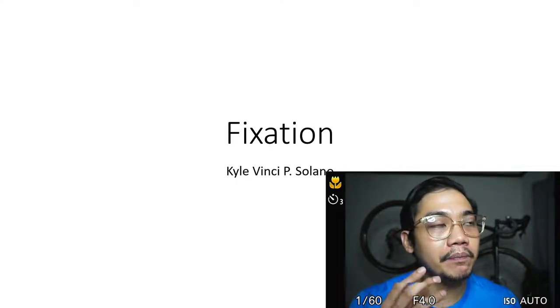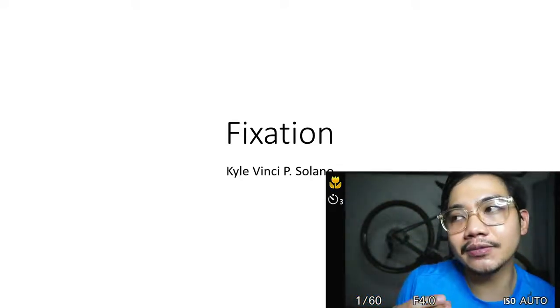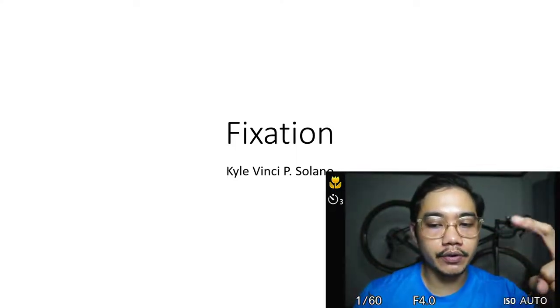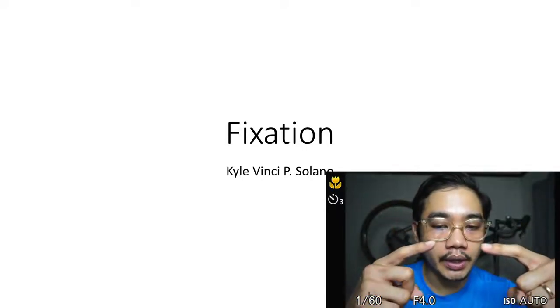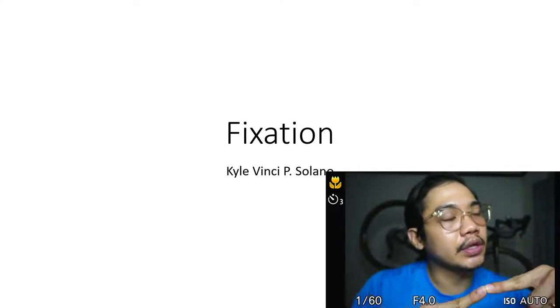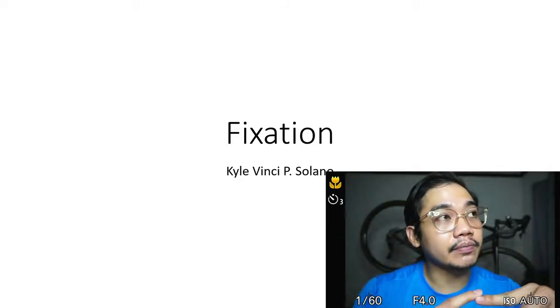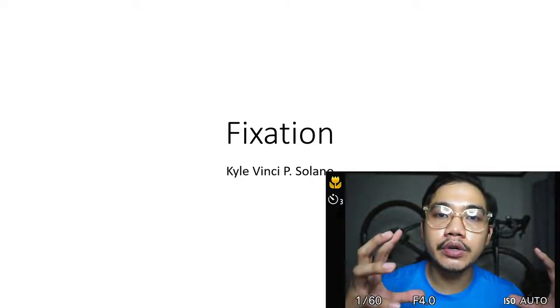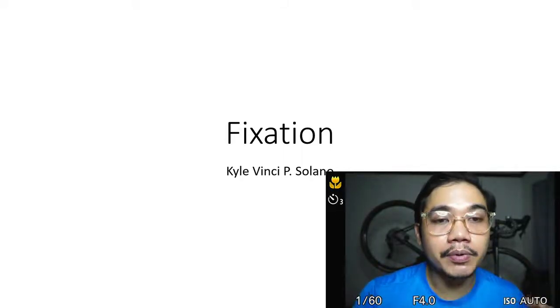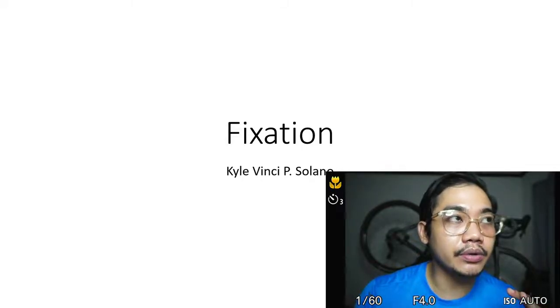What happens is they make the individual proteins within the cells become rigid, no? So for example, this is a protein, free-flowing, moving around. The fixative tends to make it rigid by forcing it to have bonds with the adjacent proteins. In a sense, it makes the structure, the architecture, more stable, and then there will no longer be cellular processes going on, meaning ATP won't be used up, no? So there will be no apoptosis.